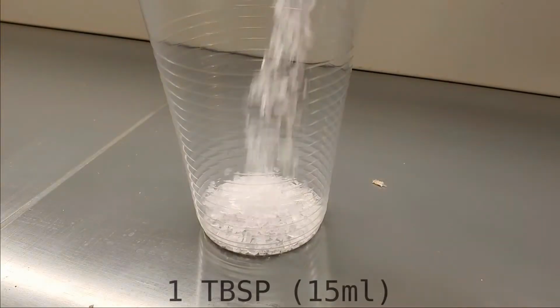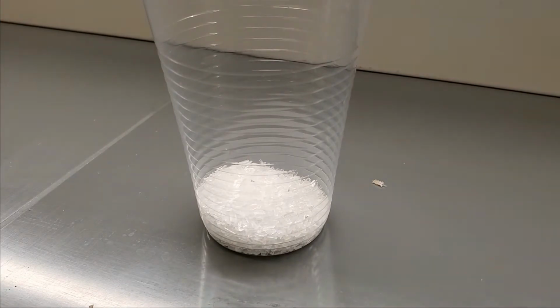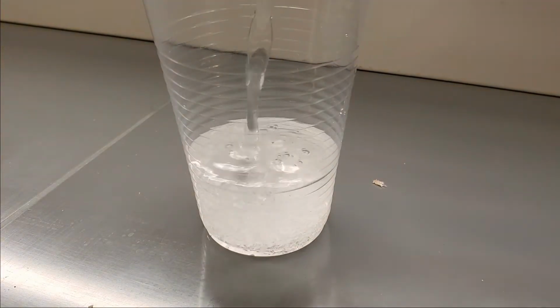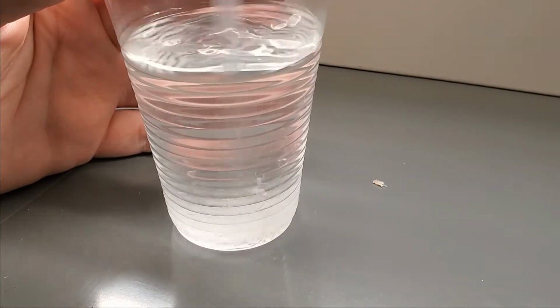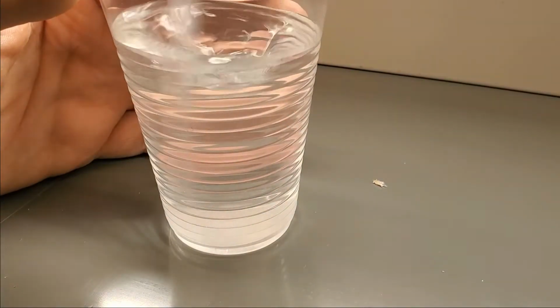Measure out 1 tablespoon of the magnesium sulfate and pour it into a different plastic cup. You're then going to pour in the water, 120 milliliters or half a cup. Mix the solution until the magnesium sulfate has fully dissolved in the water. This is going to be our electrolyte for our electrolysis.